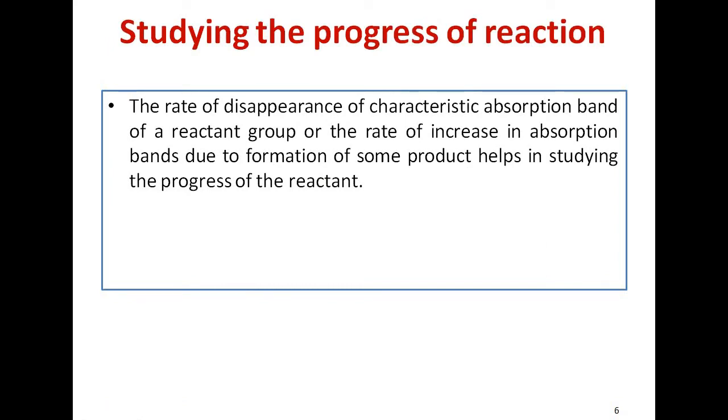The next important application of IR spectroscopy is studying the progress of a reaction. The rate of disappearance of a characteristic absorption band of a reactant group, or the rate of increase of the absorption band due to the formation of the product, helps in studying the progress of a reaction.